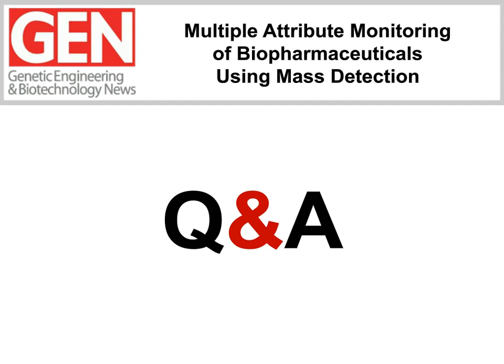All right, great. The next question is, is the deconvolution software for the QDA data available for both Empower and MassLynx, or just MassLynx? So that's a good question. Currently, the deconvolution software is only part of the MassLynx solution. It has not currently been implemented within the Empower workflow.